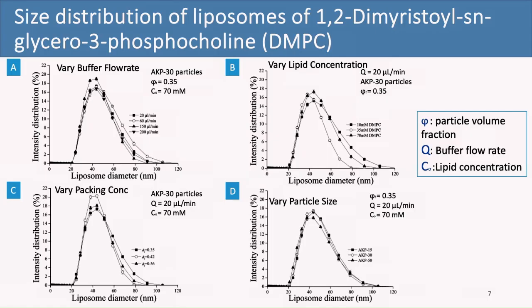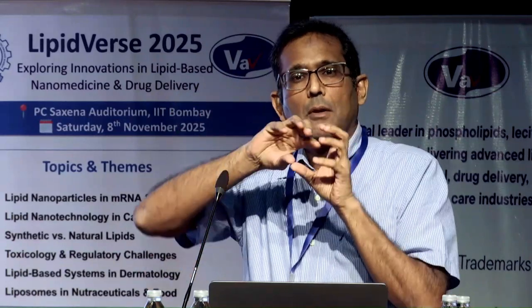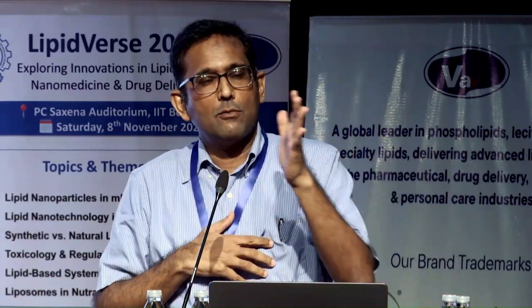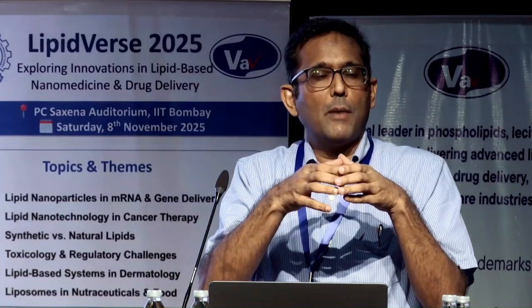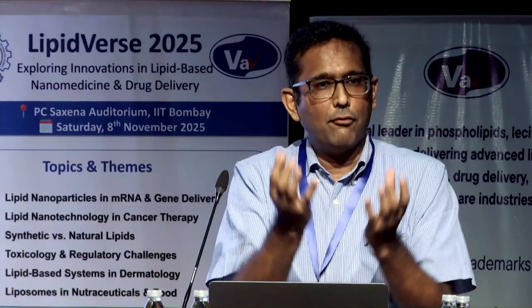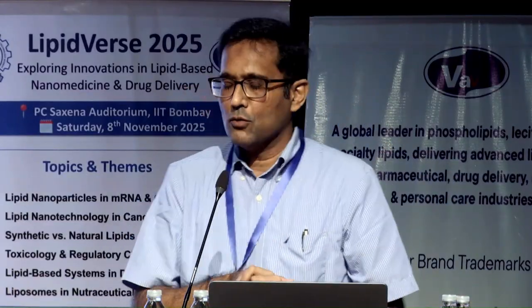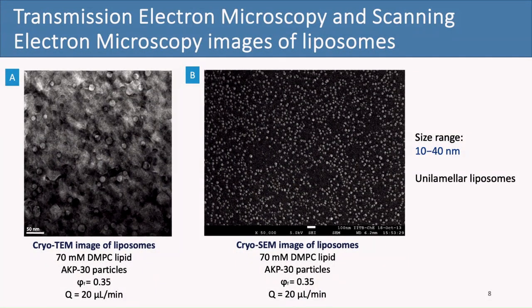And so what we hypothesized is that it is those sharp curvatures which lead to the formation of patches of these, maybe the bilayers which are sitting. And when the aqueous buffer goes through, it hydrates them and those fold. And the size of those bilayers is determined by those high curvature surfaces. And that limits the size of the bilayer. And therefore, we are able to get these very nice liposomes, which are sub 100 nanometer, right? And of course, the proof of the pudding is in eating, as they say. And so we took TEM and SEM images, and you can see that these were extremely monodisperse. And so we were very happy with these results at that time.